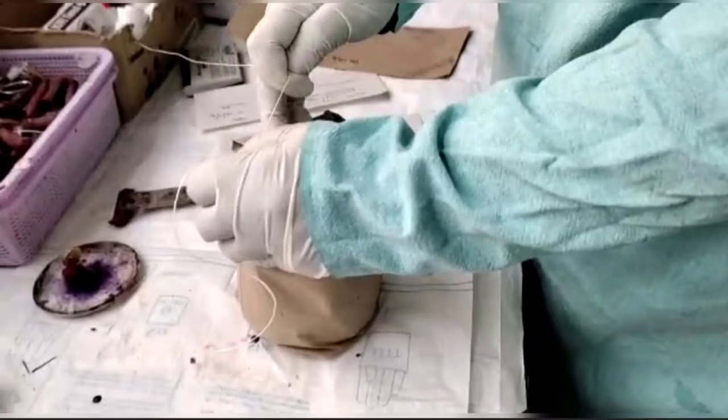Hello students. This is a video demonstration of labeling, packing, sealing and forwarding the Viscera.